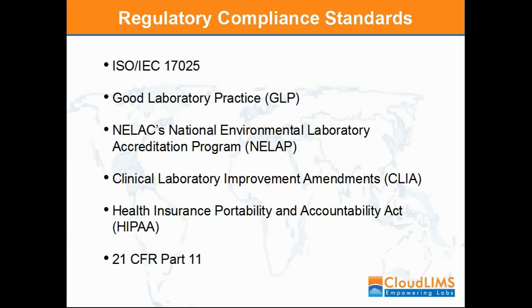In order to ensure that the testing lab continues to be ISO 17025 compliant, they are regularly monitored through proficiency testing. If a lab shows poor performance during proficiency testing, it needs to determine the factors responsible for poor performance and take the appropriate corrective measures.